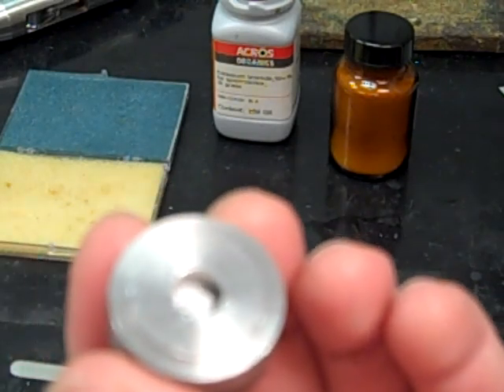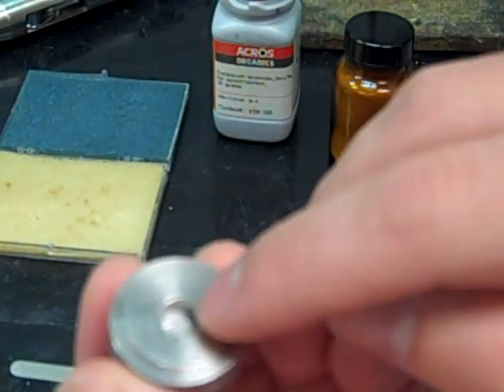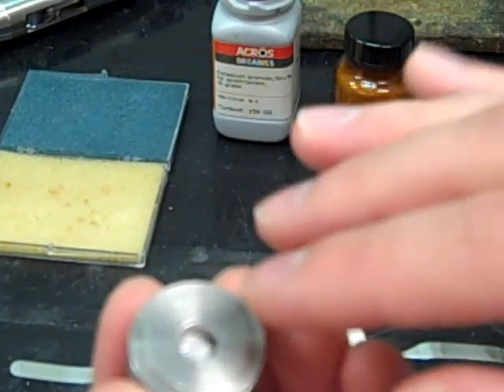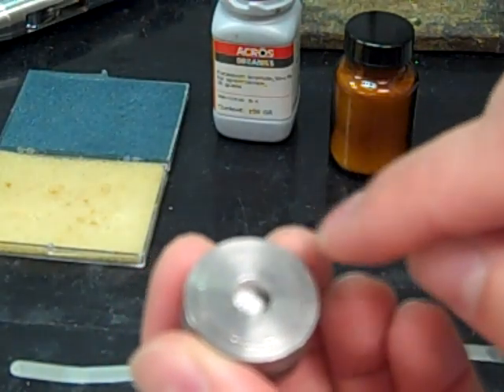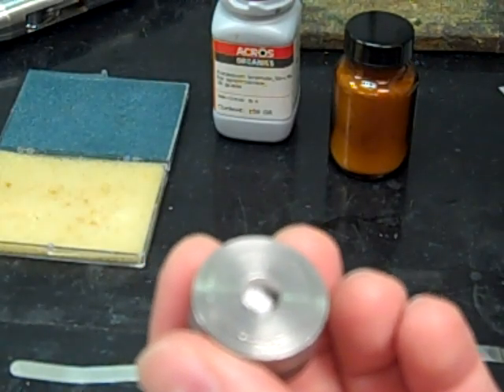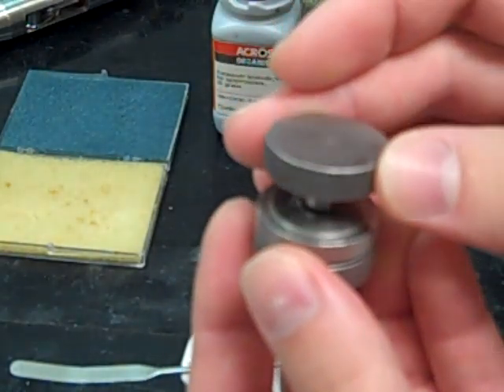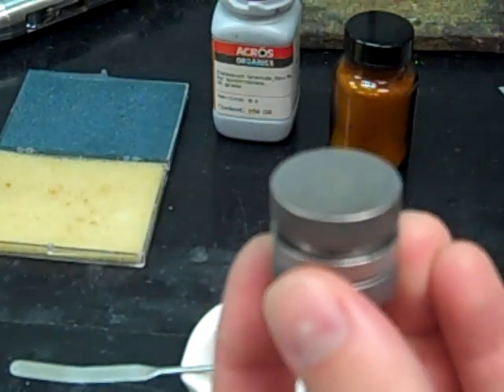So you probably won't be able to see it too well with this kind of zoom, but there are a few places where the metal is poking through, so it's not a full solid cover of that powder, but it's kind of spread throughout. If you have a little spatula, you could even spread it inside of there to help you get even distribution. That might even be a little bit better. So once you've gotten this evenly spread, and this, like I said, might take a couple attempts, you're going to put the top part of the donut on, and now you're ready to press.